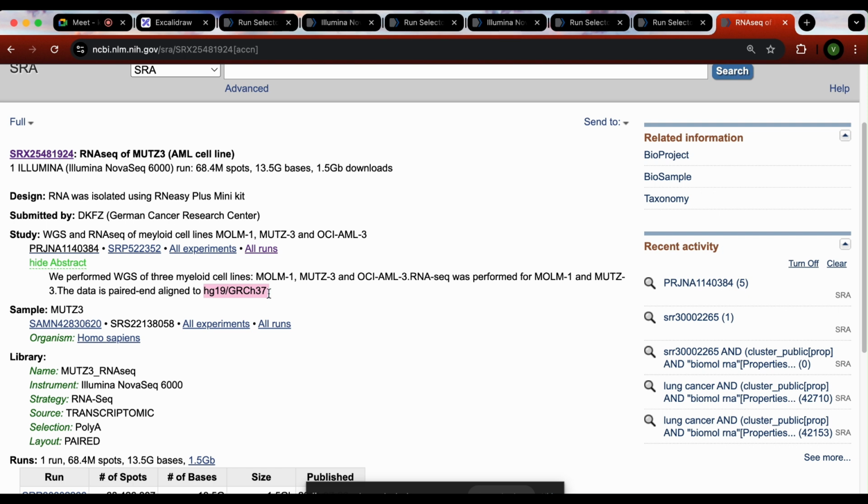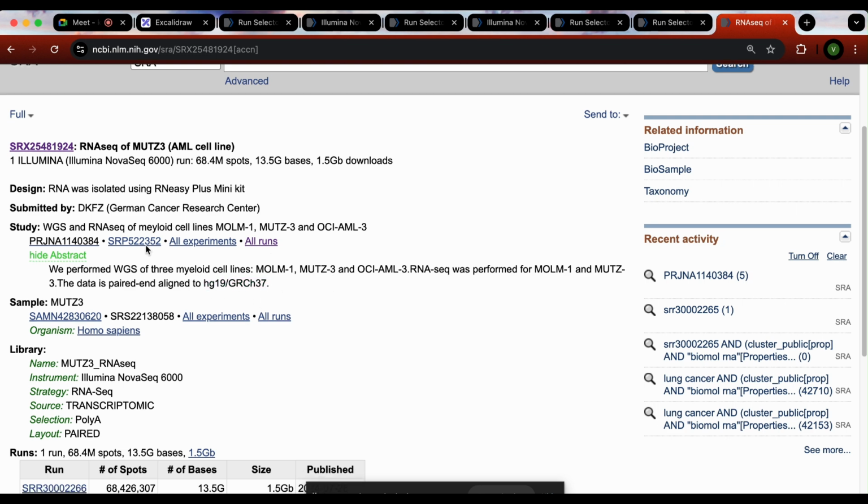Over here, if you want, you can again align with another reference. That is up to you. I'll teach you how to do that. This is just a dataset where they have both the things.